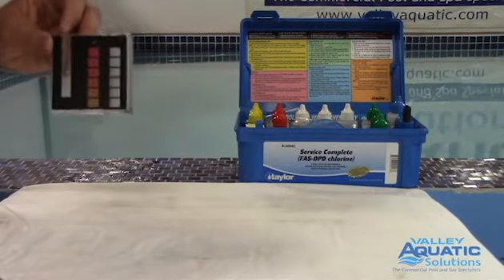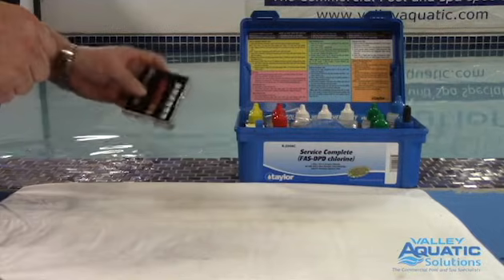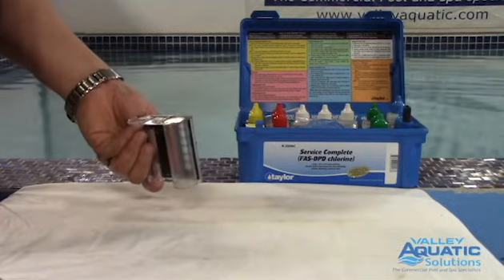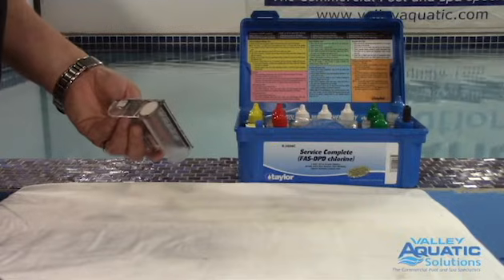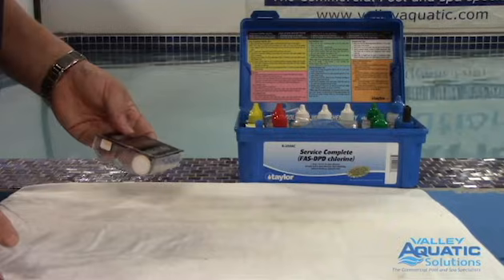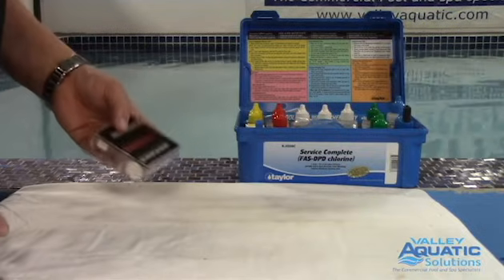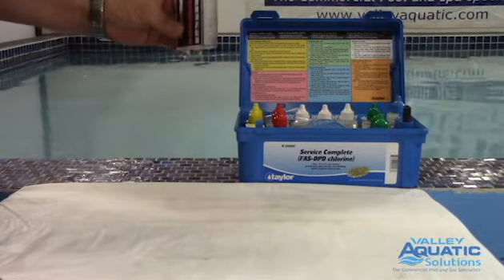We always want to rinse the comparator out before and after in our pool. When we take a water sample, invert the comparator to trap air and then go down 18 inches — basically getting your elbow wet. Why don't you want to take water off the surface? Because all the nasties float on the surface: the bacteria, the chunkies, everything we're trying to kill or filter away. You'll actually get a lower chlorine level on the surface. So invert the comparator, go down 18 inches, then come up with your water sample.